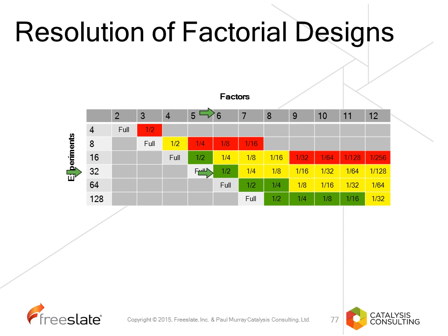If we chose to run 6 factors in 8 experiments, we would be running a resolution 3 design. In a resolution 3 design, we can rule out some factors, but we'll have no information about the interaction. And when we see a factor as being important, that factor may be confounded or confused by having some interactions hidden behind the data.